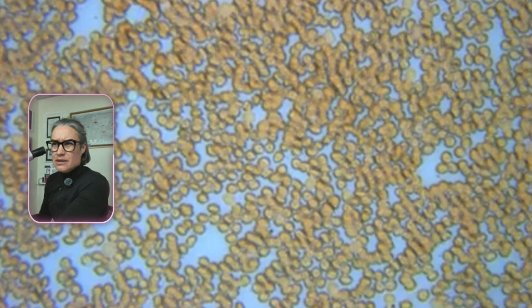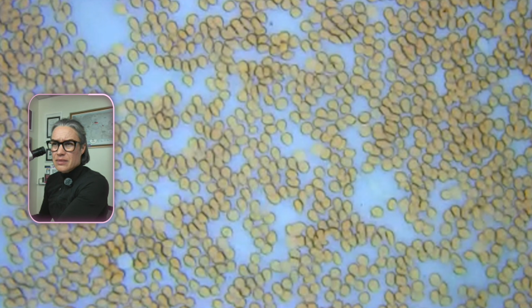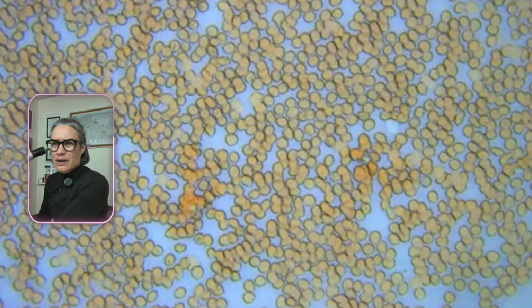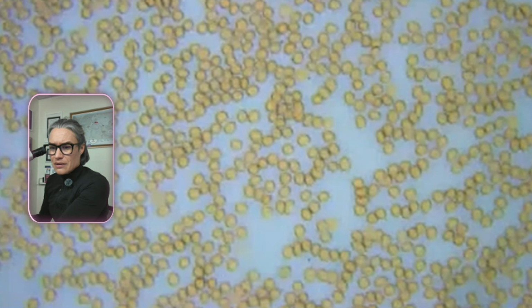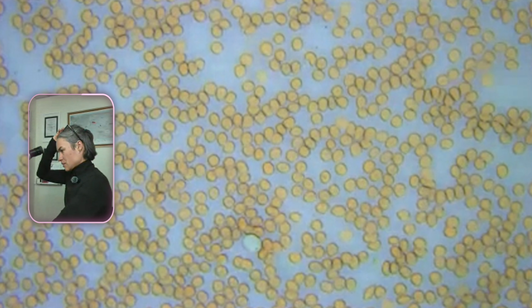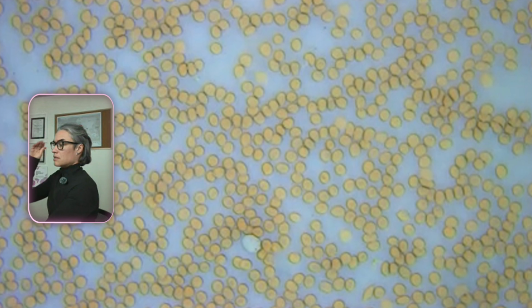So one of the reasons can be that we didn't stain it, so that there is no stain in them. They are white and not red, like they're. Wait. No, I don't think so. This looks like just some kind of bubble. I'm determined to finding it. Maybe it is one. Let me go through the microscope. Maybe it can be one, but I don't see its nucleus, so I don't know why. I want to see something with a nucleus.